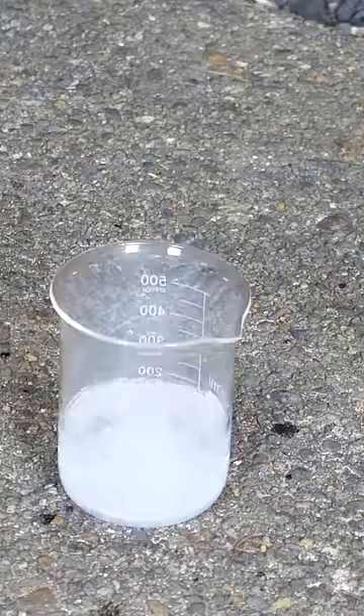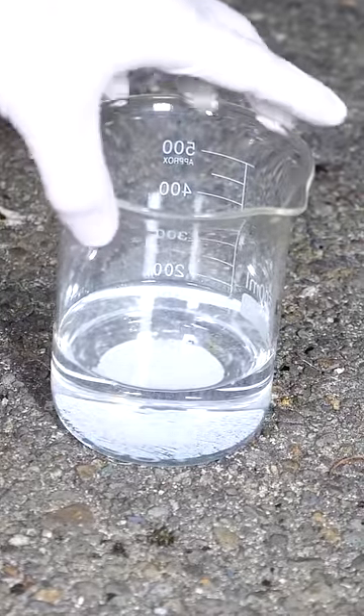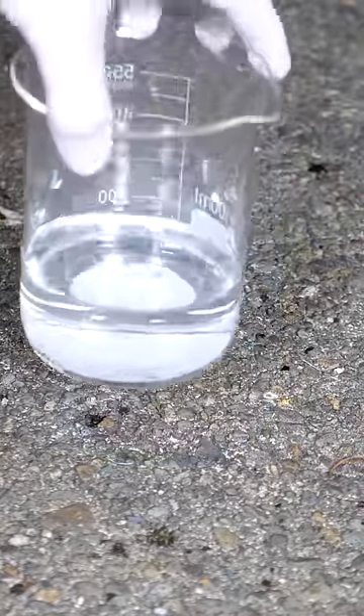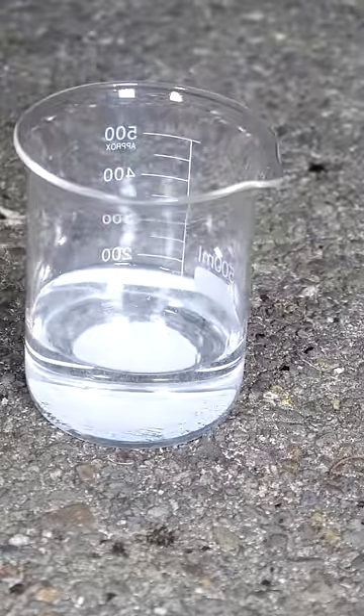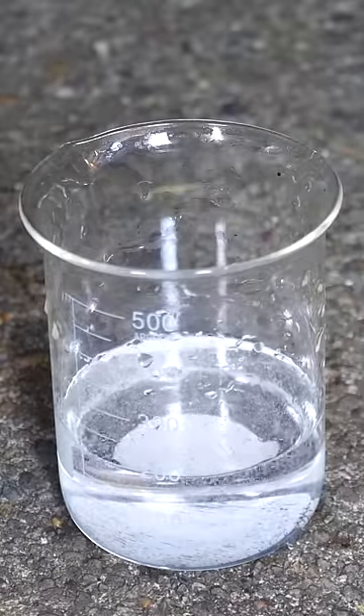So all you're left with in the end is just a clear solution — the thing you put in there was completely turned into water and CO2. The water is left there and the CO2 just turns into a gas and leaves. So that got me thinking: diamond contains carbon, so can Piranha Solution dissolve diamond? Let's check it out.